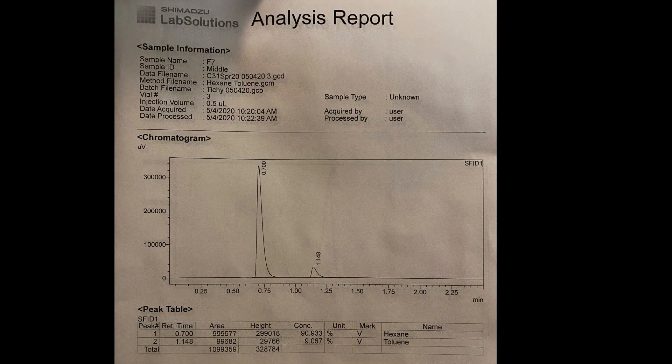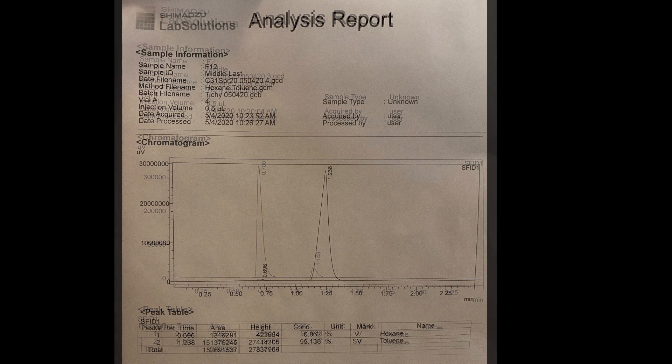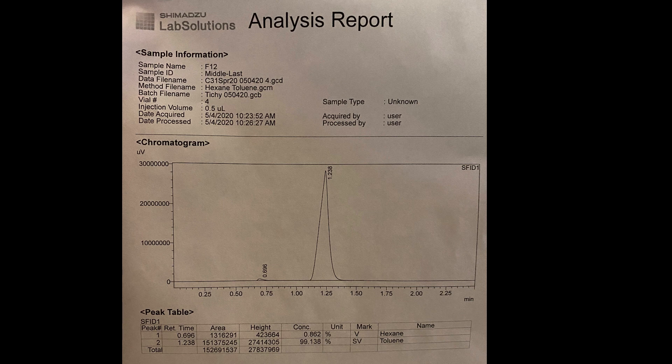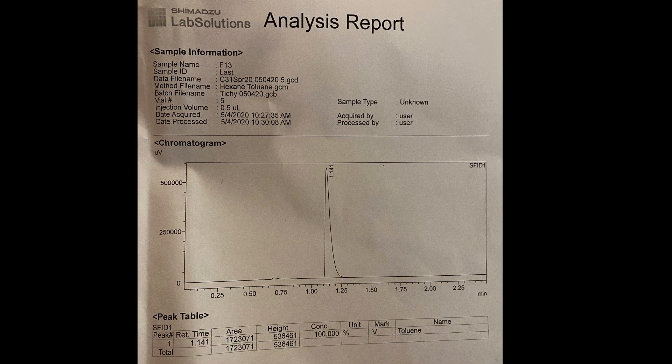Fraction 7 contained 90.9% hexane and 9.1% toluene. Fraction 9 contained 0.9% hexane and 99.1% toluene. And the last fraction, fraction 10, contained 100% toluene.